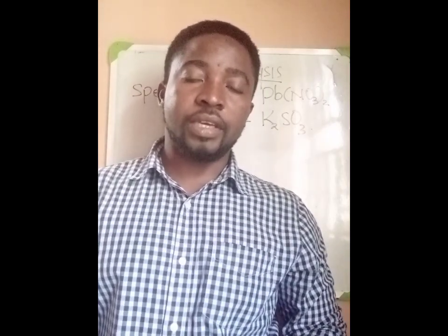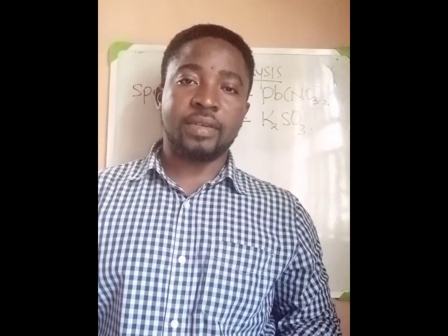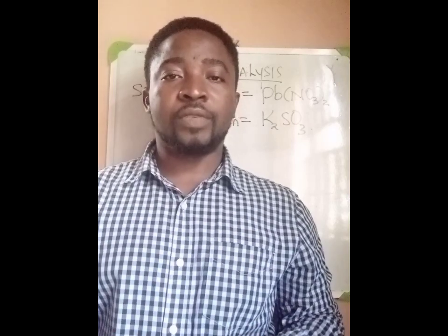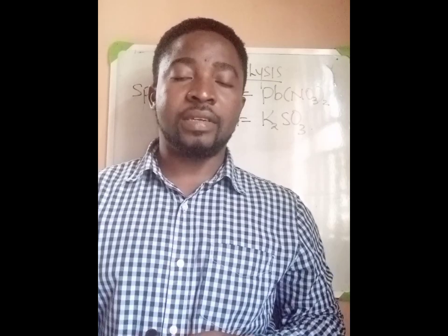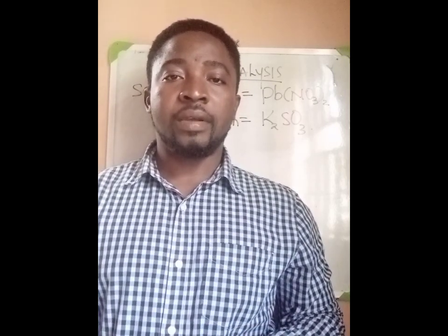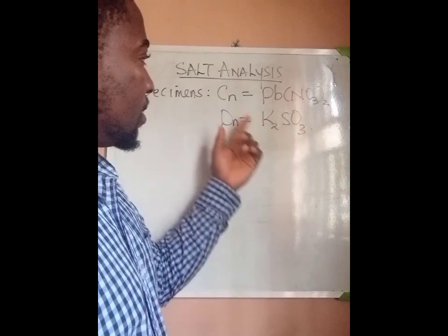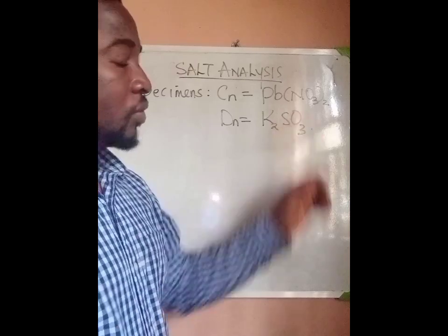In today's video, I will be taking you through salt analysis for NECO 2025 chemistry practicals. In this video, I will be showing you the likely questions to expect in this forthcoming practical examination. So without wasting much of your time, let us look at the specimens that were provided for this year's salt analysis. Now, one of the specimens is lead nitrate, and the second specimen is potassium trioxosulfate IV.